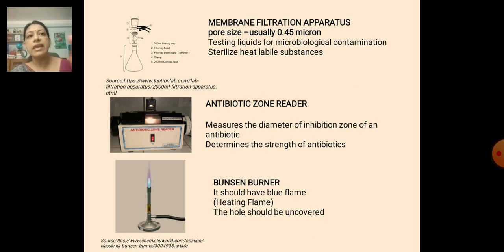One is that we can sterilize a bulk solution which is thermolabile using this membrane filtration apparatus, and the second thing we can do is, if you want to check whether any microorganism has grown in that pharmaceutical product or any liquids, we take up this membrane filter, put it on the Petri dish having the culture media, and allow it to incubate for 24 hours or 48 hours, and we check whether there is any microbial growth or not.